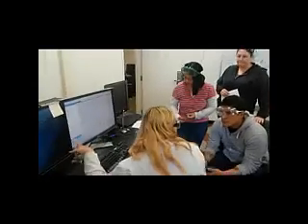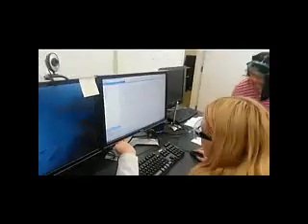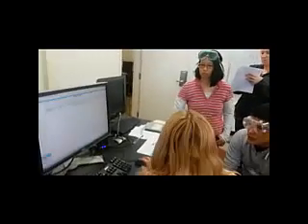So in order to get the data from the HPLC, you have to go under the data analysis tab. That's how I went to find the print. Then in here, you need to find yours, which, how do I explain? In the column, it's not named after your name. It's named after the method that you used. So you need to find the method that you used. Caffeine. I'll show you.